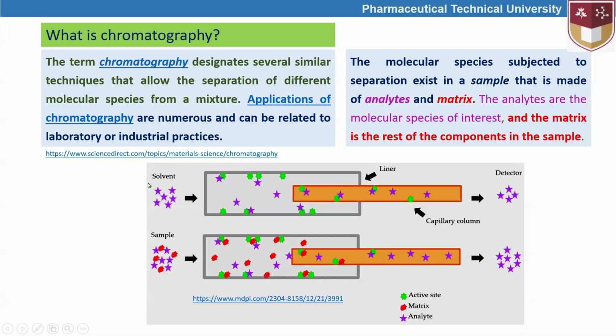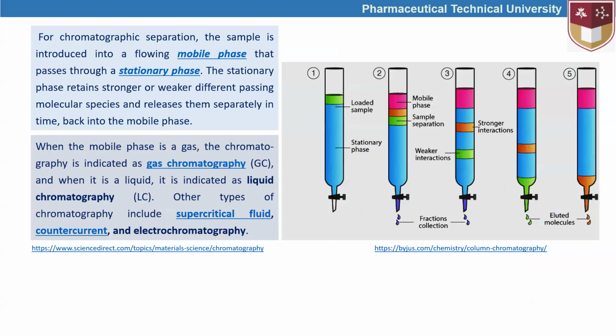And the active compounds, I mean the analytes, are separated from each other by the elution of solvents. So this is about how the chromatography is carried out.